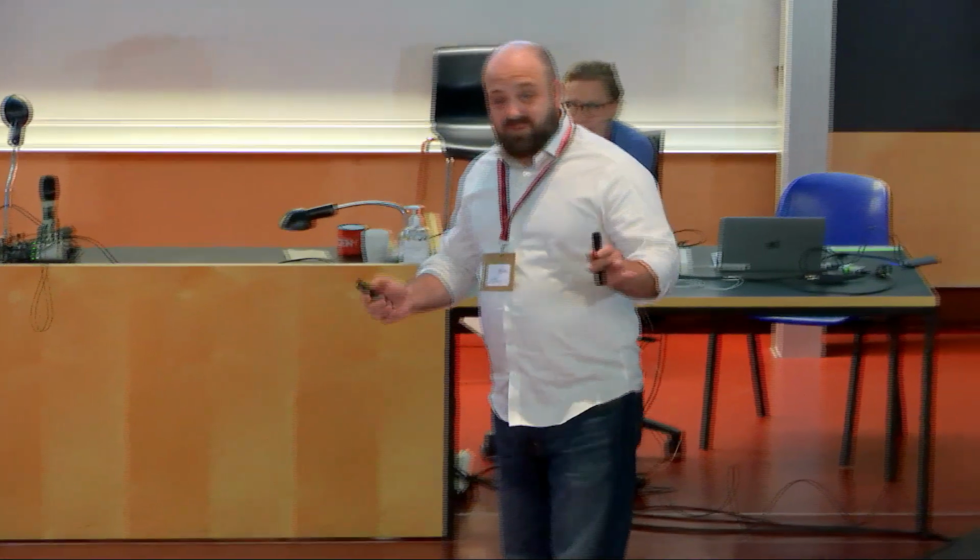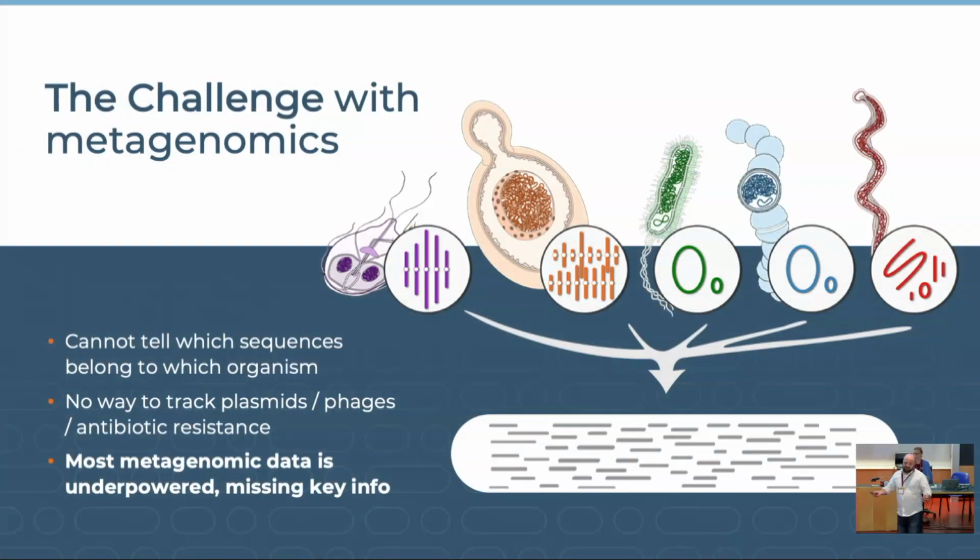What I'm going to talk about today is a technology we've developed that really solves one of the key difficulties in the study of microbiome and therefore the holobiome. And that is the simple fact that if you're studying any kind of microbial community, any kind of mixed community, maybe it's not even microbial, you're dealing with an issue where the moment you purify DNA to sequence it, it's mixed, right? And so we've heard a lot about this already, like Professor Sorensen discussed today, right?